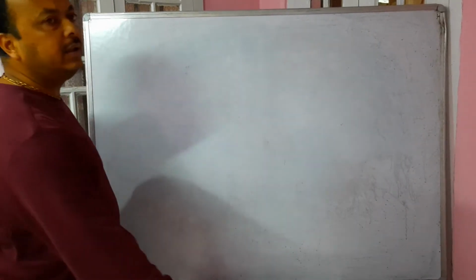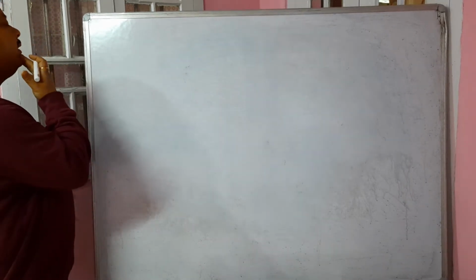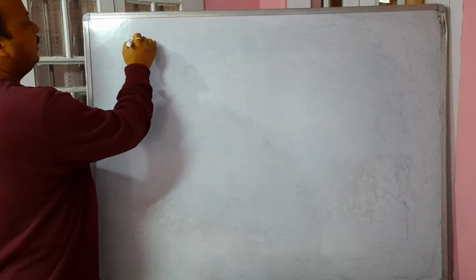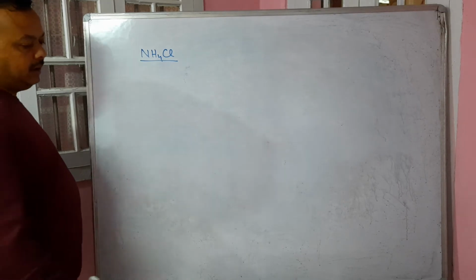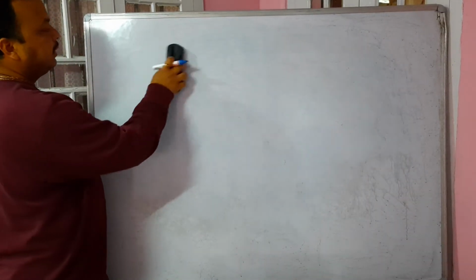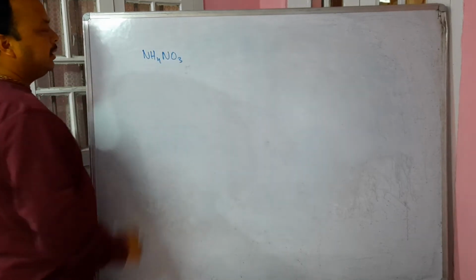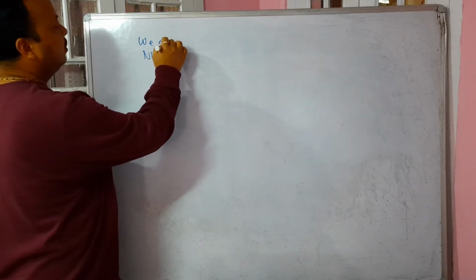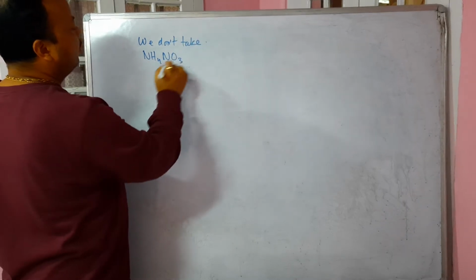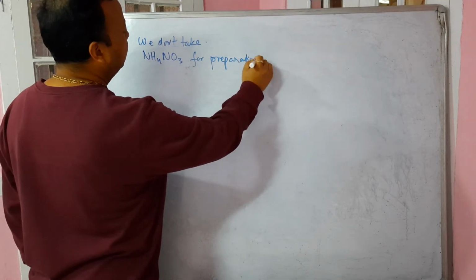Let us continue. Can we take anything else apart from this salt of ammonium that we have taken? When we talk about ammonium chloride, this is what is usually used for preparation of ammonia. But there are other salts of ammonium also, for example, ammonium nitrate. We don't take ammonium nitrate for preparation of ammonia.